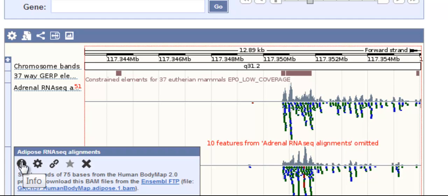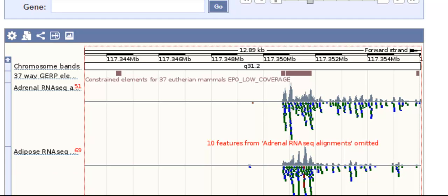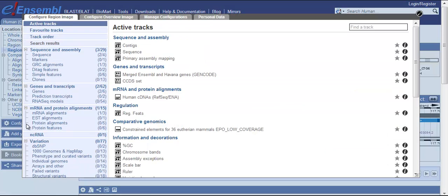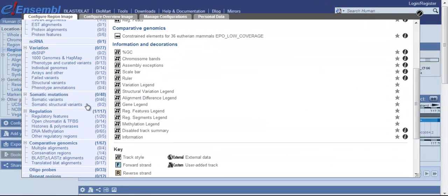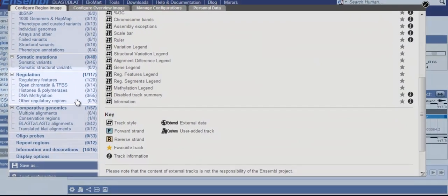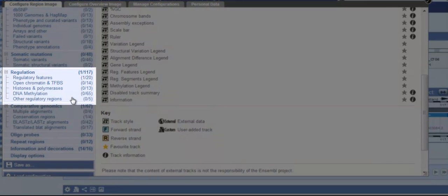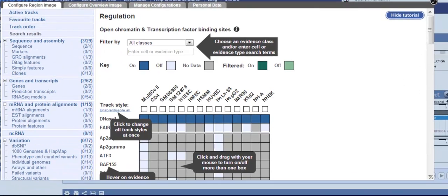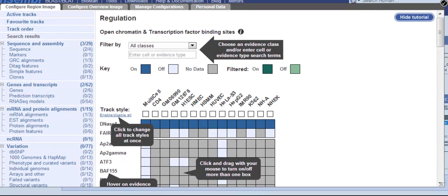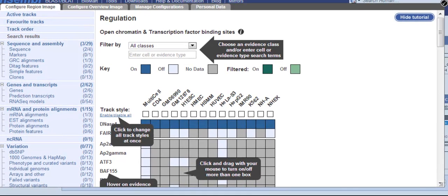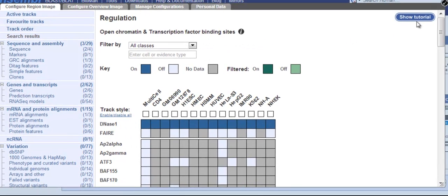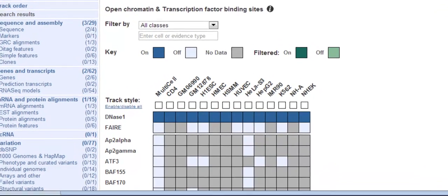Let's take a look at the matrix for regulatory features, many of which are based on ENCODE data. Click configure this page. Move down to the Regulations section. I'm going to click on Open Chromatin and TFBS for transcription factor binding sites. For now, I'll hide the tutorial.